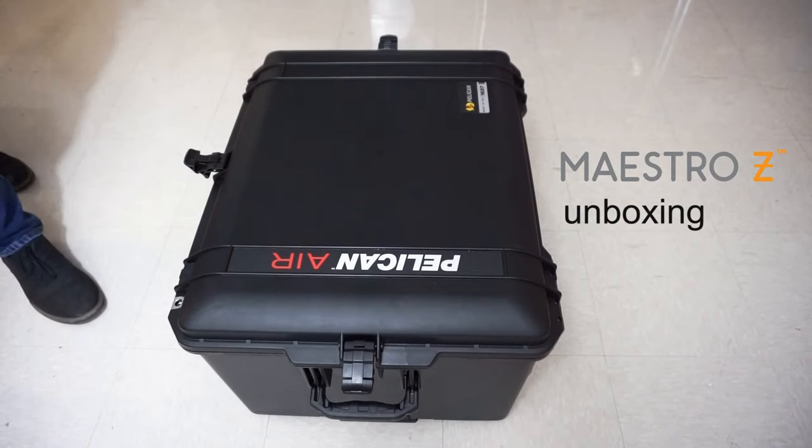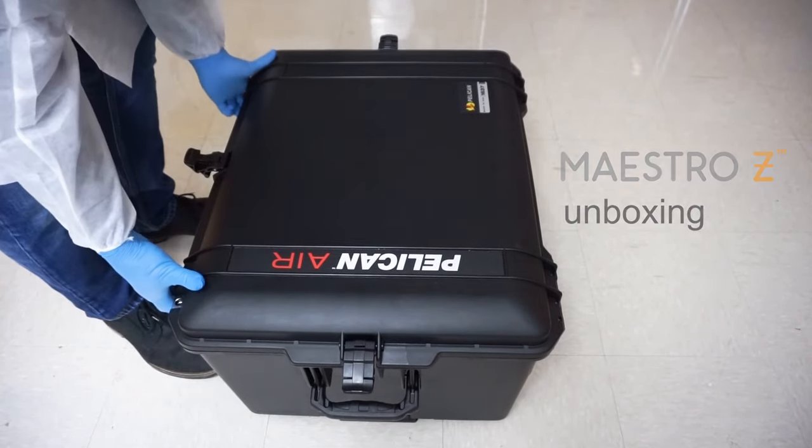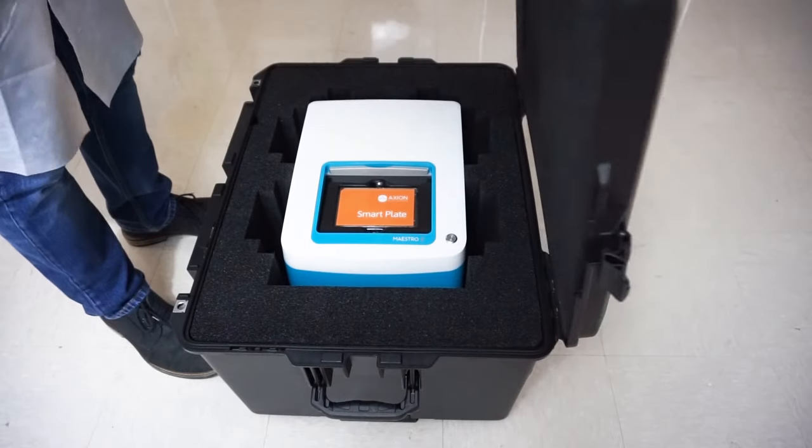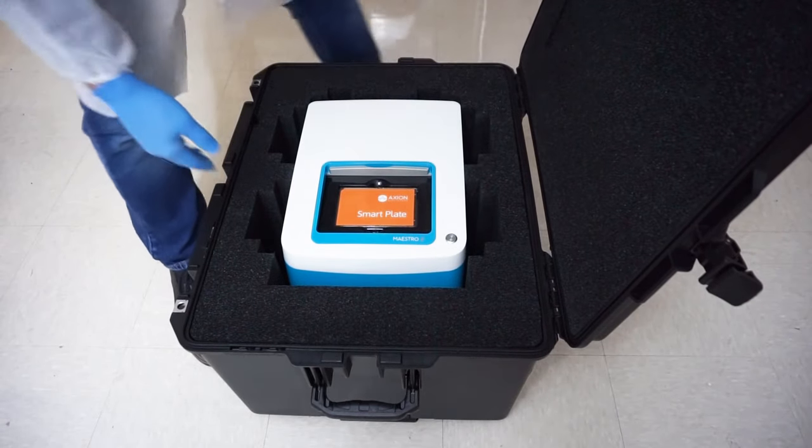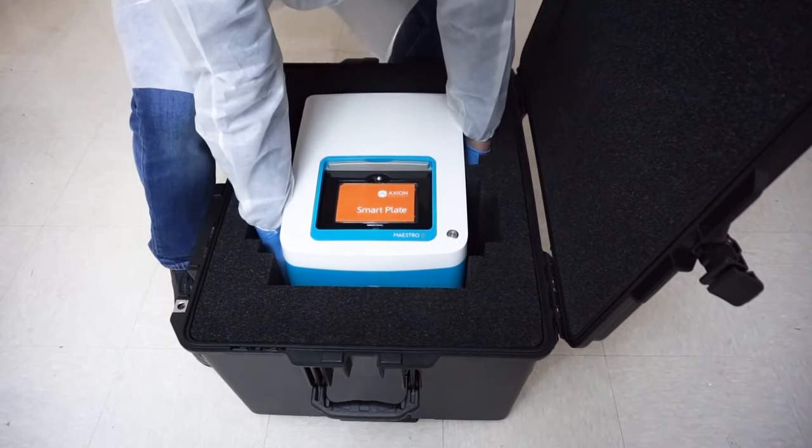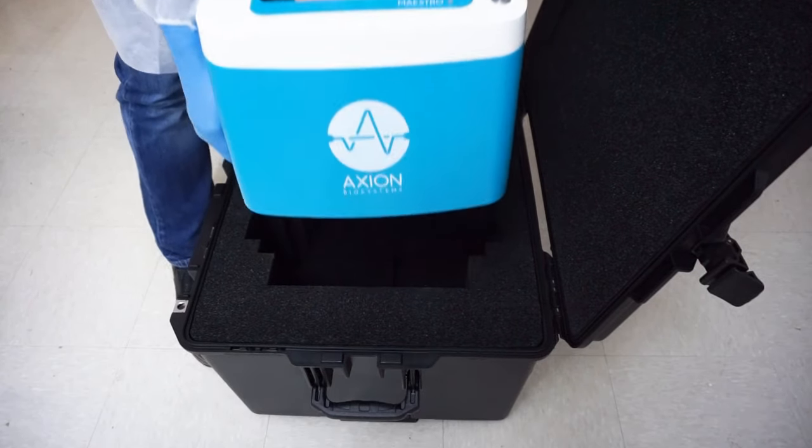Axion BioSystems' new Maestro Z impedance-based cell analysis system allows you to track cell proliferation, morphology, viability, and barrier function, label-free and in real-time.